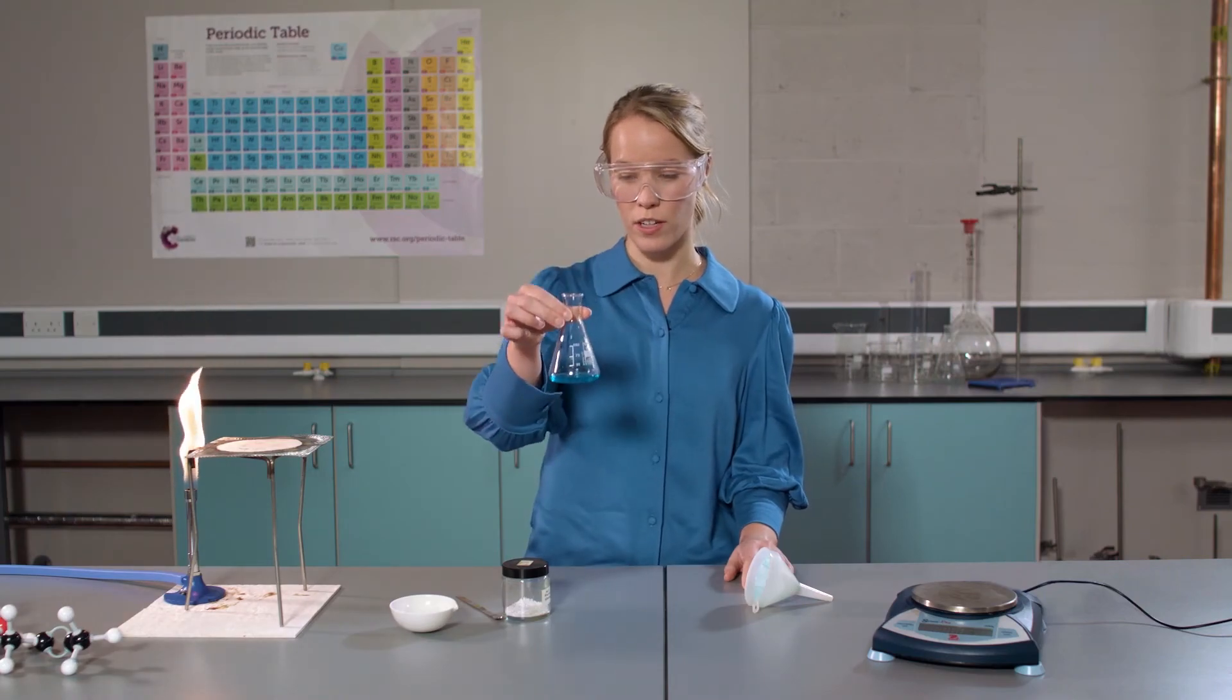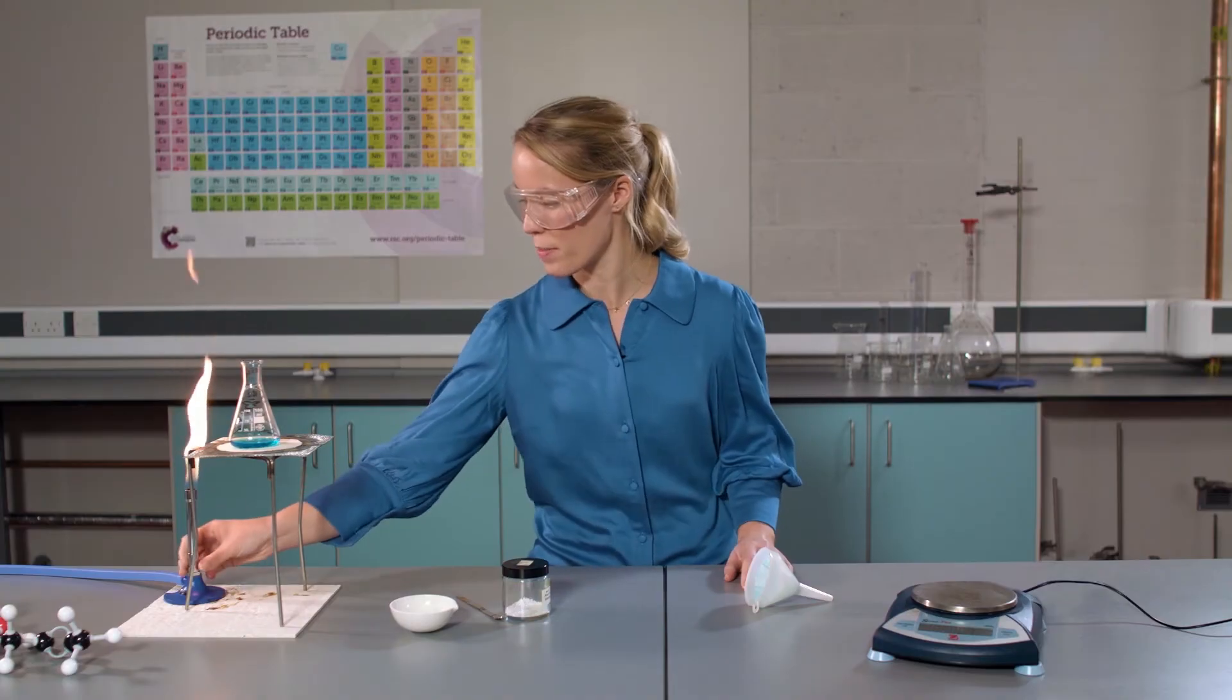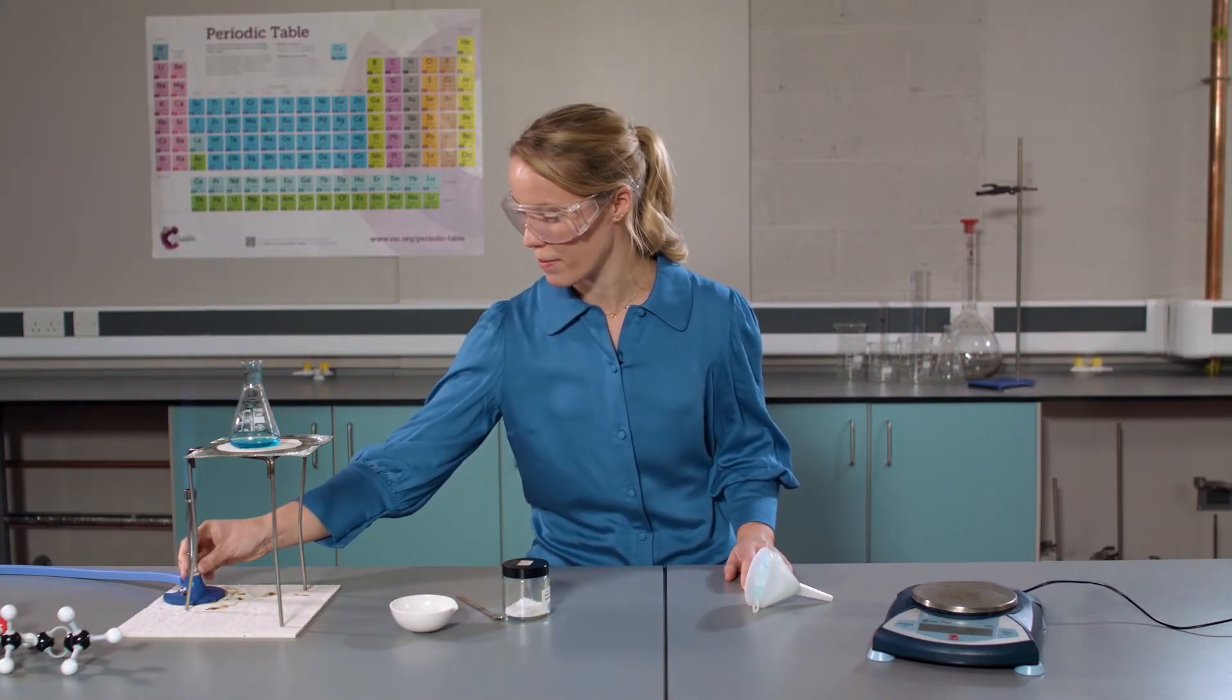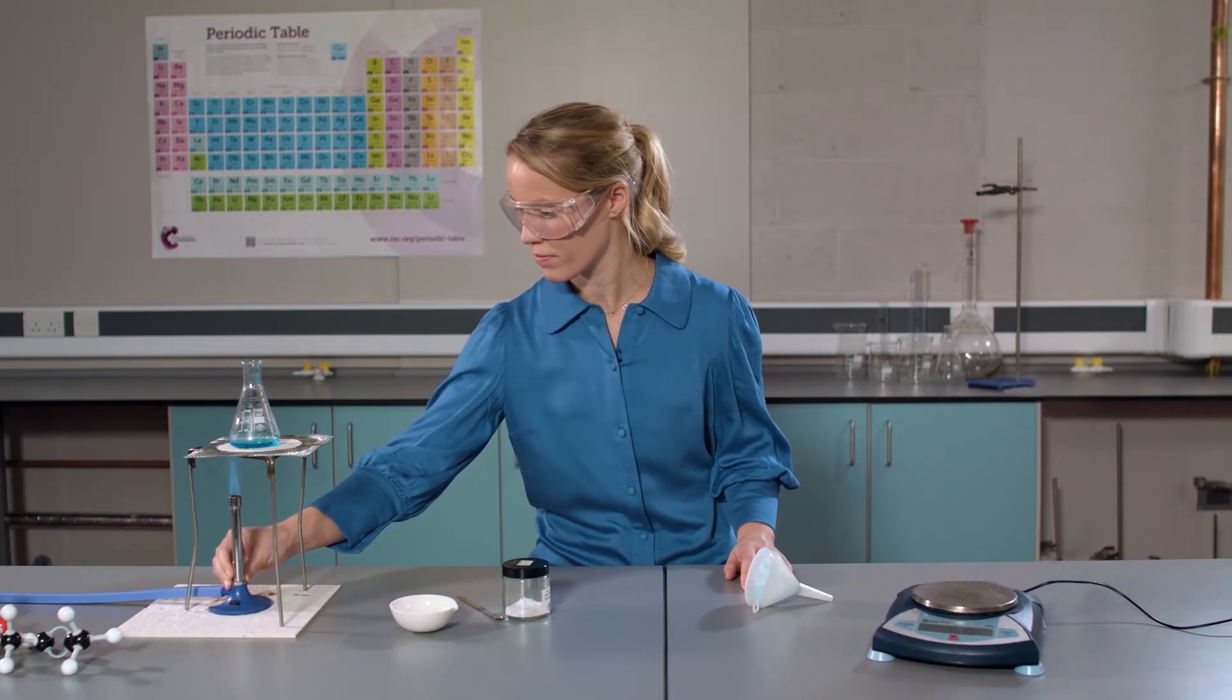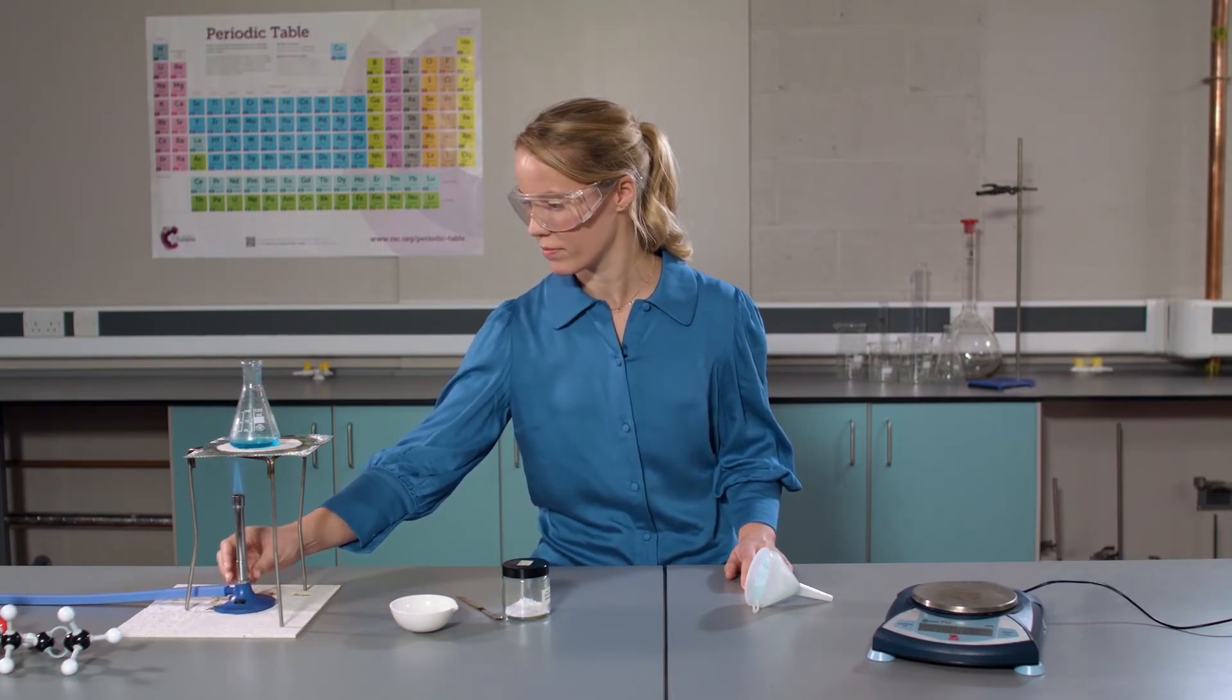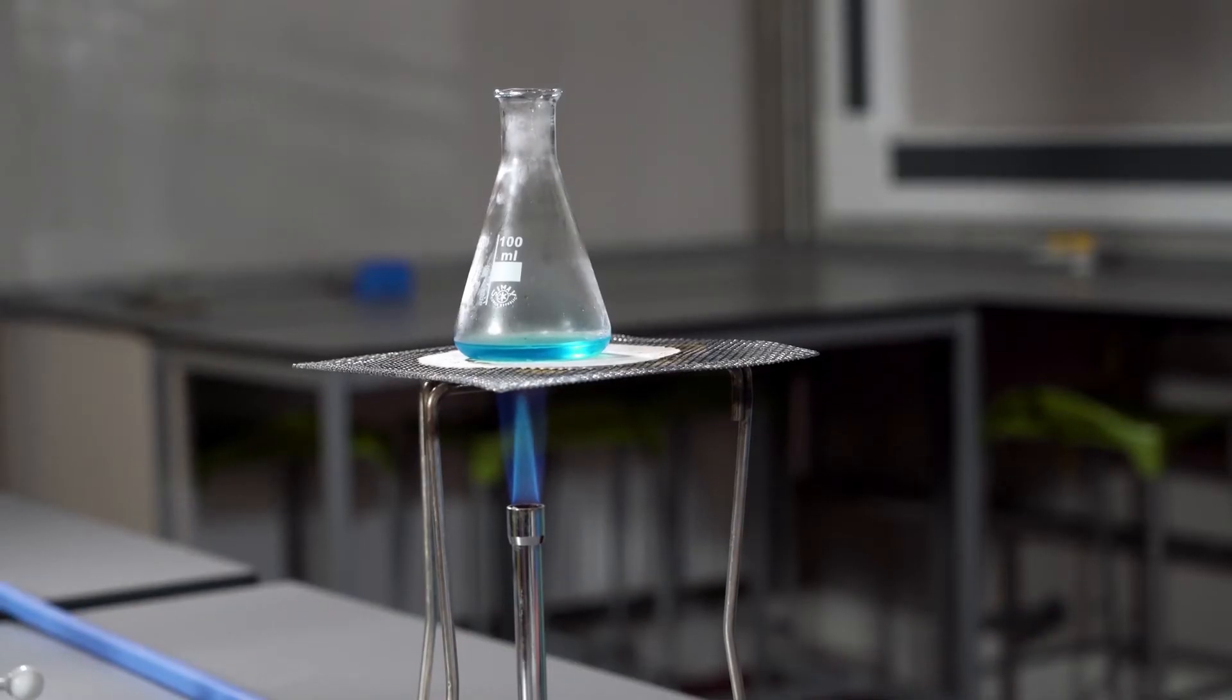Now I'm going to place my conical flask on my tripod and turn the Bunsen burner to the blue roaring flame. It's important that you let this gently simmer for two minutes only.